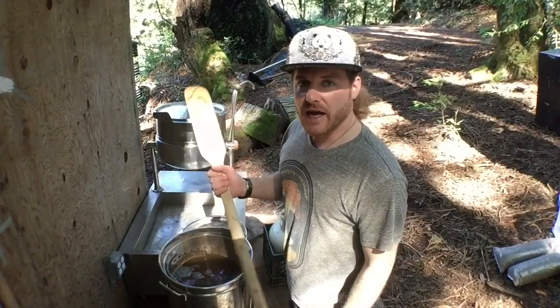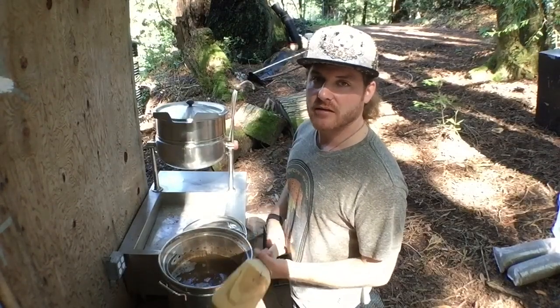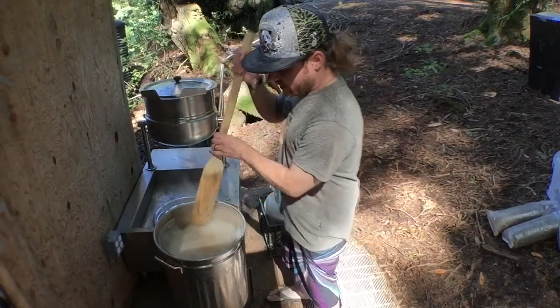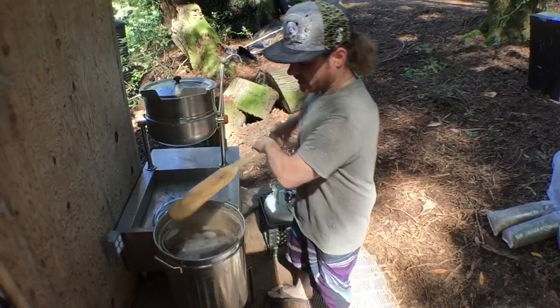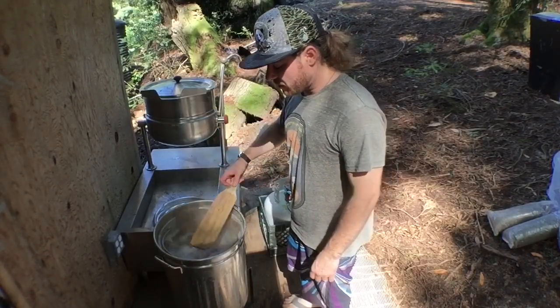I really recommend getting one of these paddles. They're a lot of help, and they'll save you from burns, and they'll make the job a lot easier. Our grains are boiling, so we started a timer, and now we're gonna give it a quick turn. We'll leave the top off at this point, and we'll just monitor them and check one or two.